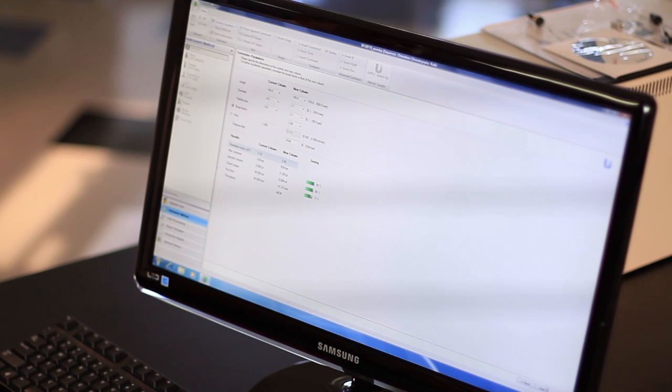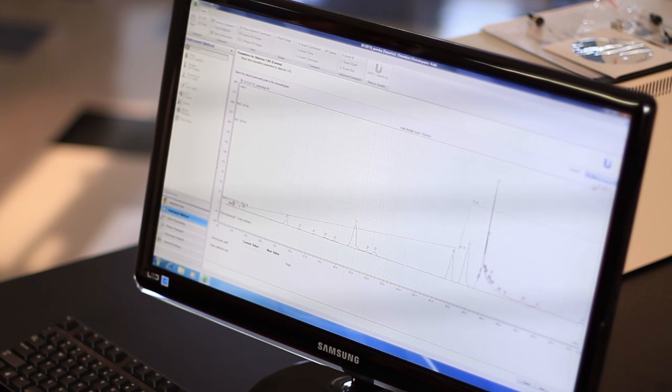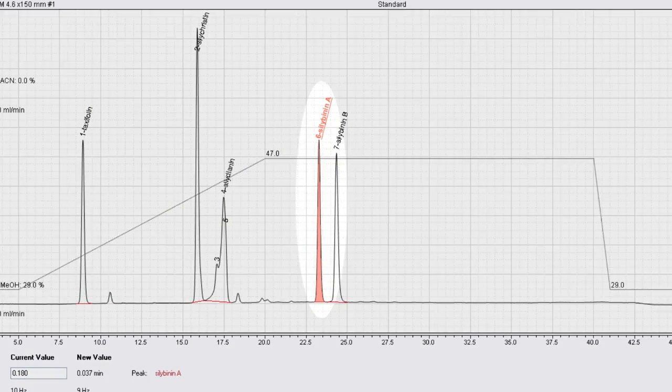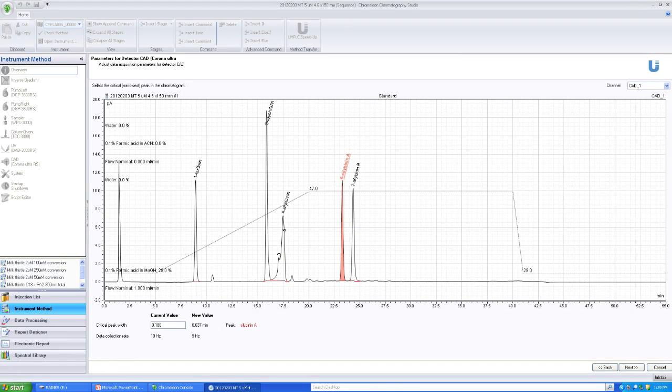Advancing to the next step, I can also define the critical peak width. That helps us determine the acquisition rate for the new method — as we have faster peaks, we also need a faster acquisition rate on our detectors.